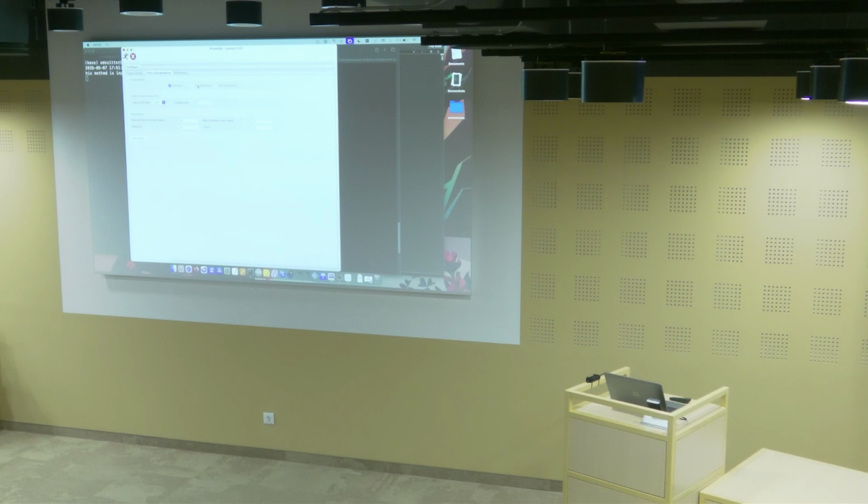So what we're going to do right now is run it in the fast and furious mode. There will be certain things which have default values, such as the Bayesian weighting schemes. We can select the lowest occupancy that we're going to look at. Let's say we want to go from an occupancy of 0.1 to 0.5, and we want to test 10 different occupancies in between. The values here are for how to integrate our difference maps. We're just going to keep that default as well.